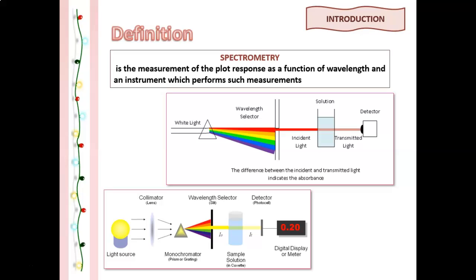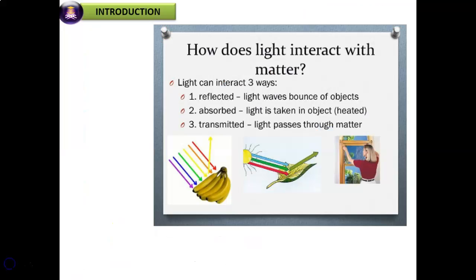And green is unique in that it can be created by absorption close to 400 nanometer as well as absorption near 800 nanometer. So earlier, humans valued colored pigments and used them for decorative purposes, as we also used the chromatography method to analyze the color directly. But this one is a very advanced instrument for you to determine the wavelength of the compound.